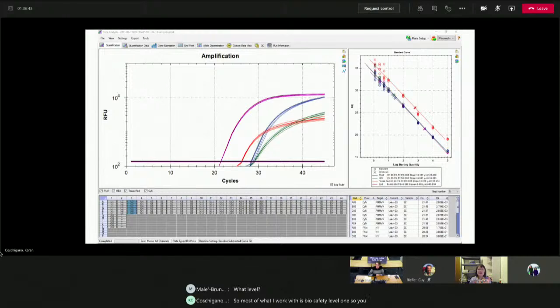So you need gloves and such, but not too dangerous. Biosafety level 2, a little more because it could be infectious. Biosafety level 3 and 4. 4 is the highest level. Those you've got to be very careful. Like Ebola virus, I think that would be level 4. So we work BSL-2 at least until it gets into that beading tube.